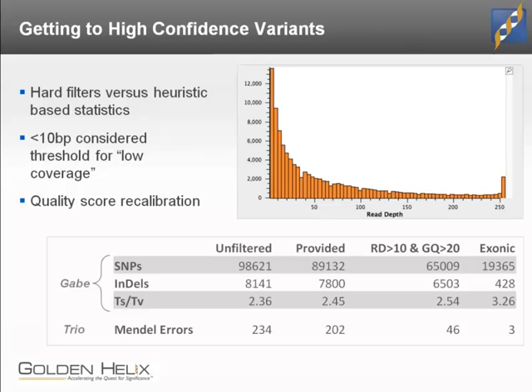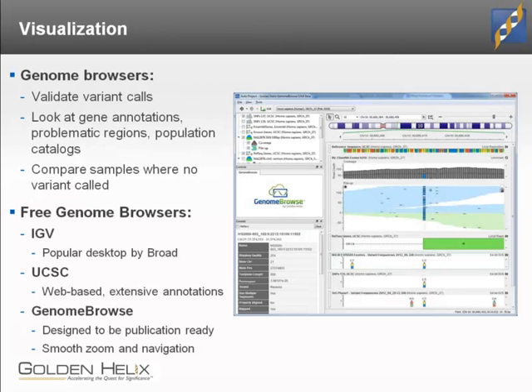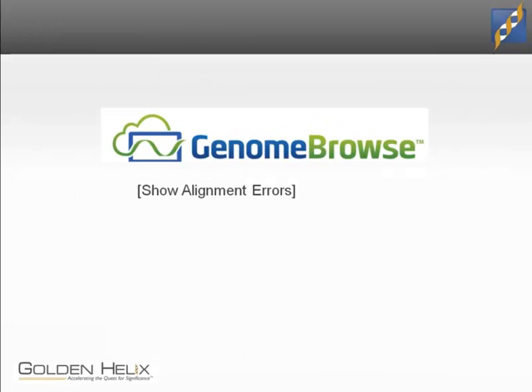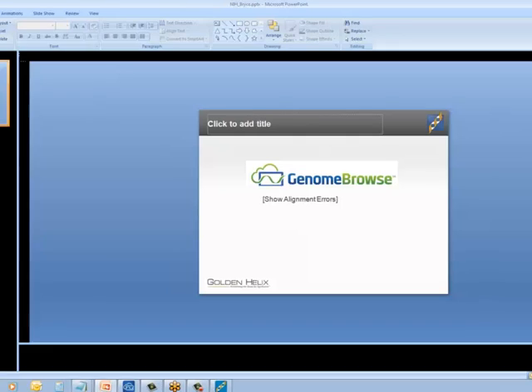So one of the most important things, though, is if you have a variant that your tertiary analysis spits out and says this is important, it's always good to just go back and confirm that there's nothing fishy about it. And just to give you an idea of some of the things to look for here, I'm just going to skip through a little further. I just want to show a few more things in the browser.